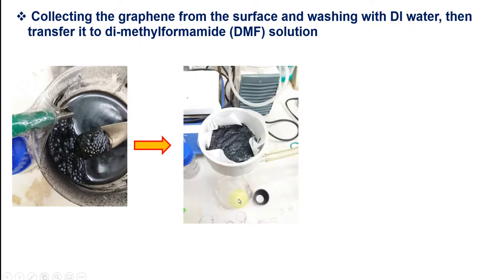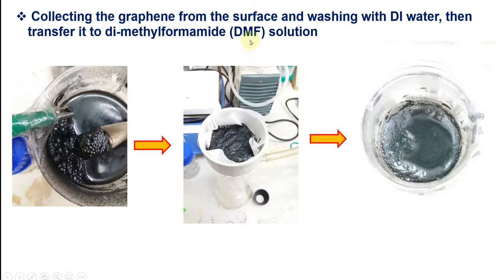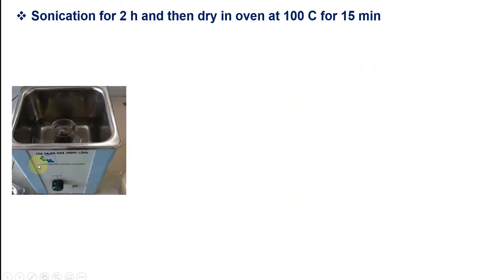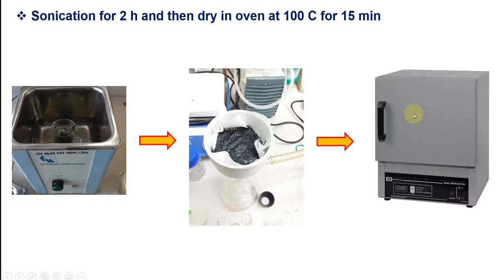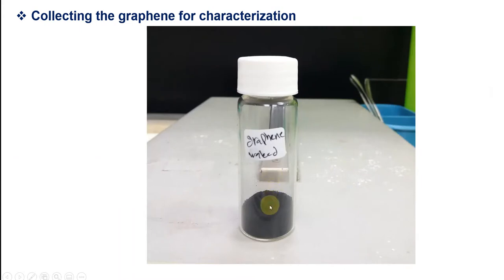I transfer it to DMF solution because it can suspend and dissolve a lot more graphene than water. I put it in sonication for two hours. After two hours, I collect it and put it in an oven at around 100 degrees for 15 minutes to dry and evaporate all the DMF solvent. Finally, I collect it using a spatula, scraping and removing it from the surface of the filter paper for further characterization.